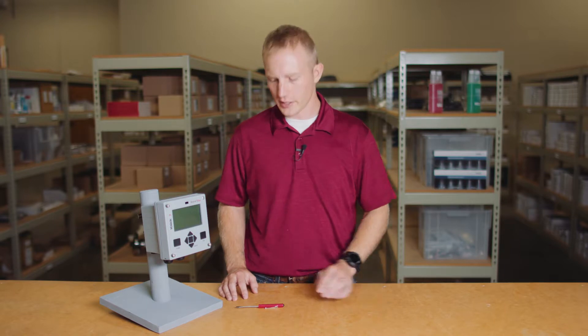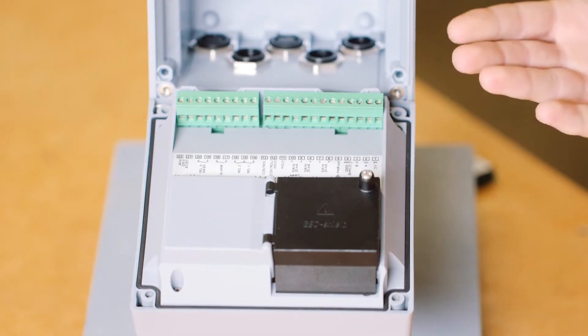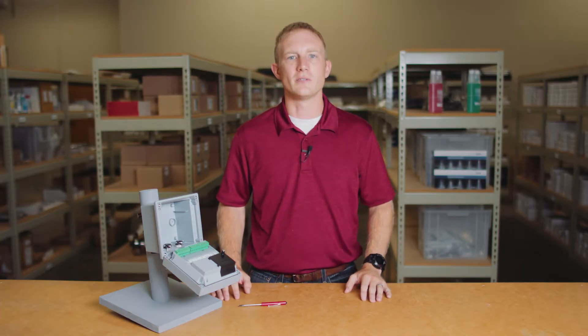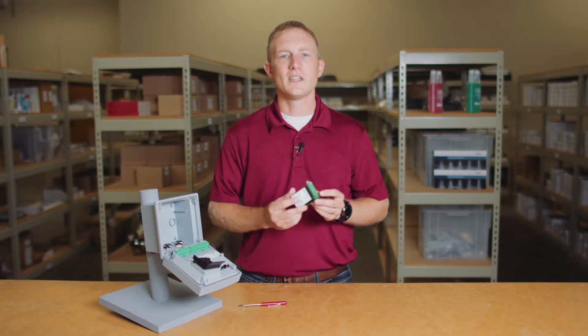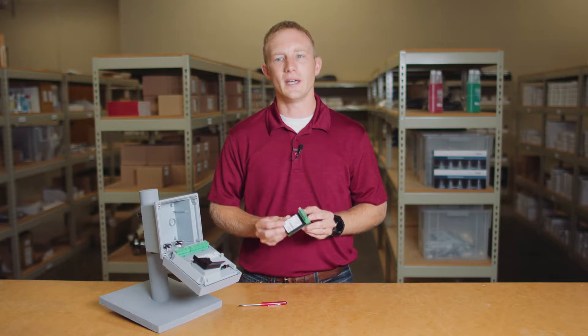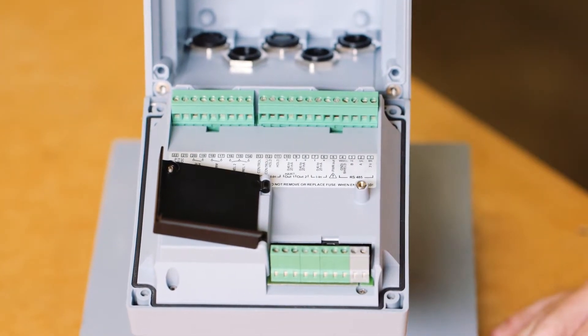The Stratus Evo is truly a multi-parameter transmitter. This single transmitter can be used to measure pH, ORP, conductivity, or oxygen. Let's start by taking a look at the back of the faceplate. The electronics are completely enclosed to protect the circuit boards from the elements. There is also an additional slot for a measuring module, which can be purchased separately and allows the connection of a traditional analog sensor as well as a second MemoSense input.